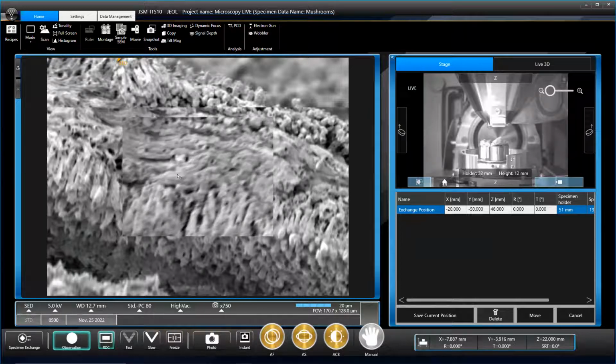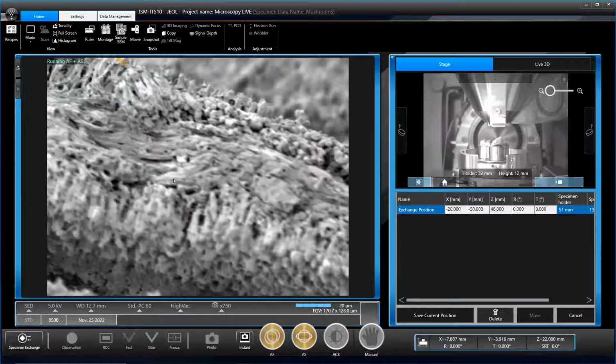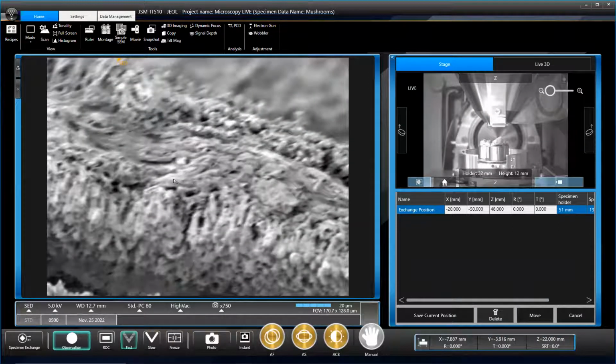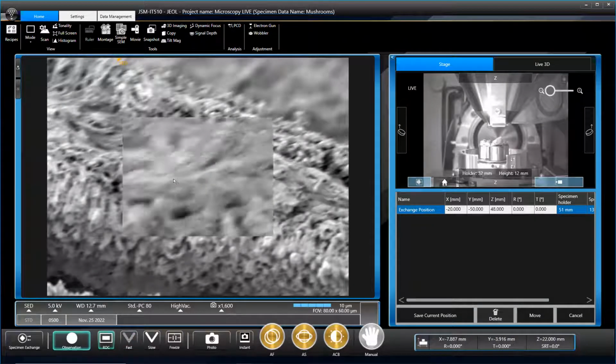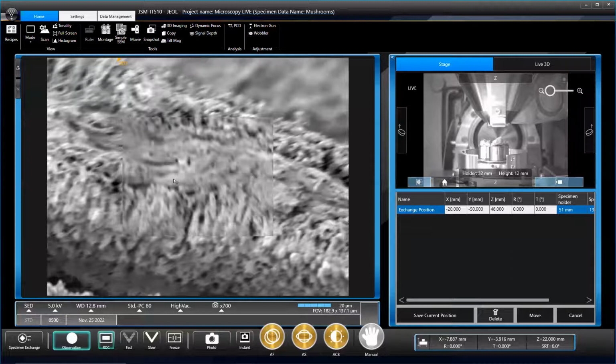It looks like what we're seeing is the basidia, which are producing the spores. So the longer, danglier looking things on the bottom half of the image. I'm going to cheat and use the autofocus and see what that does. This is one of our new microscopes. We've had it for about three months. No, that's not helped. These machines have a fair bit of automation in them, so this is actually pretty helpful for people like me who never wear their glasses.